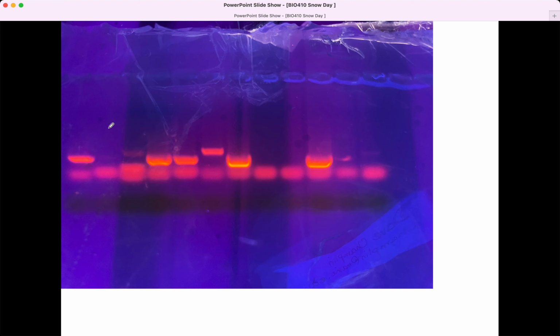So here's our data. It's a gel, and here we are using our CHINMO PCR primers that we made on the prothoracic gland. And I'm sure nobody has done this on Earth before, and so it's an interesting, exciting new result, and we got a really interesting result. It's a really important result to me, so I already repeated it and am working on it further, and we can talk some more about that. We're going to be done with it for our course, but know that I'm going to excitedly move on with it.